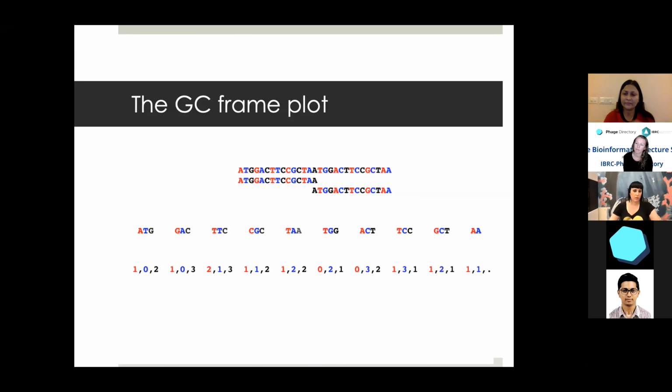That's one of the reasons I get away from reference-based learning anytime I deal with phages. I've thought about actually adding reference-based learning to PHANOTATE because it's really easy. It would make some predictions that much quicker, and it would predict the things that we already know very easily. But Glimmer can run two ways.